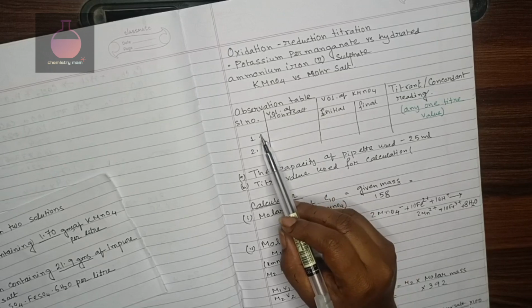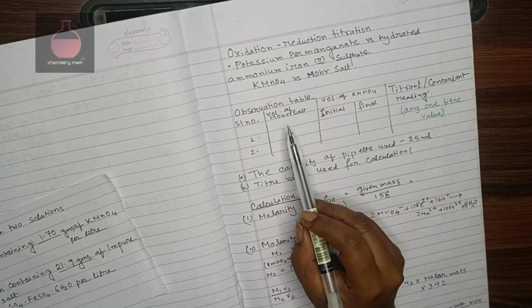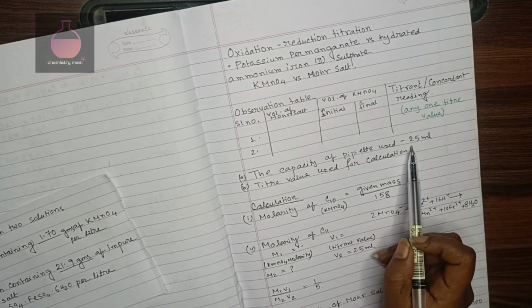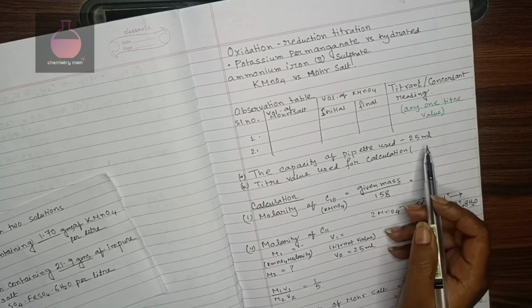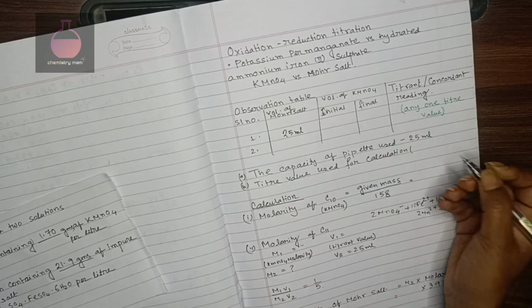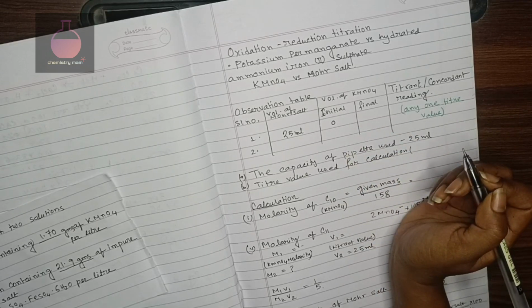Here, first your Mohr salt will be pipetted out, meaning a pipette will be provided, and you need to take out Mohr salt from there. The capacity of the pipette used is 25 ml. You can use 20 ml also, but that needs to be mentioned. Generally we use 25 ml, so you will write that. Initial and final: generally we start from 0, so you will mention initially 0.